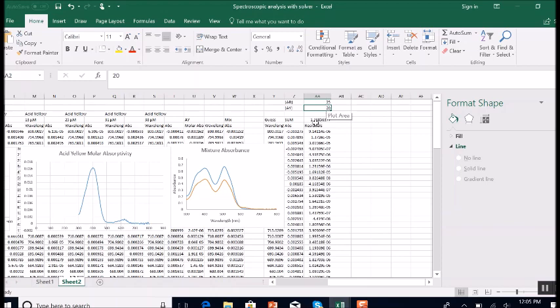By changing the numbers a little bit, we got a smaller residual, and that's what we wanted, and the graphs got closer together. So let's make another wild guess. Oh, my guess was too big. We got worse in this area, lower in this area, and our residuals didn't get much better. So you can sit here and play with this for a really long time if you want to, and get your numbers closer and closer together.